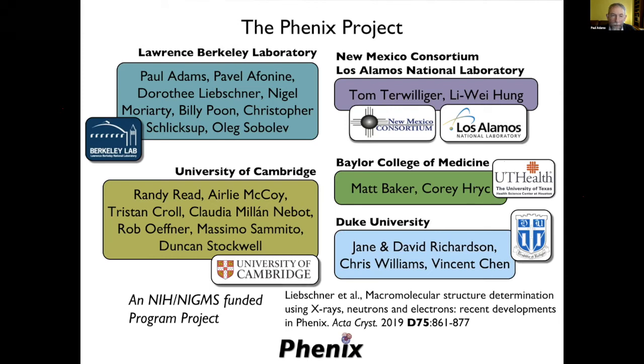That's something that we're working on implementing in refinement. So in the future, we would definitely recommend probably using that intensity-based function for refinement that accounts for the weaker data and the large uncertainty in the data, and using that with the full data set, and, as Pavel says, not using a cutoff for the data.